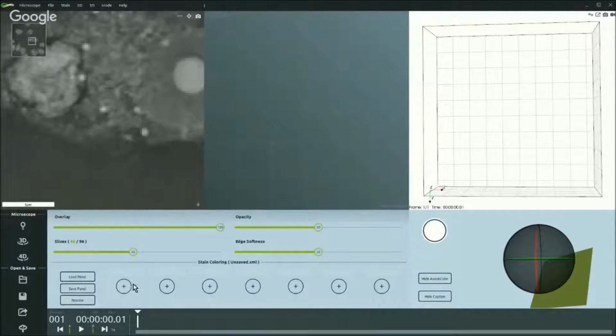The only thing I have to do is to go down here and select a color. We like to do vesicles in red. And what you see is that when I'm moving the lens over this left panel, the central panel has some pixels lighting up. This is because the lens is touching some pixels with a specific refractive index or index gradient.